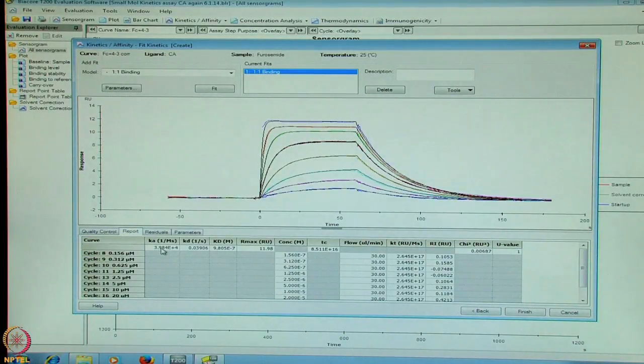The report shows on rate, off rate, affinity constant or binding constant, flow rate, differences in the refractive index of the sample and the running buffer, chi-square below 1 and U-value below 25. So this data shows the interaction of furosemide with carbonic anhydrase is 9.8 into 10 to the power of minus 7 molar. With this, we go to the next tab and analyze the data.